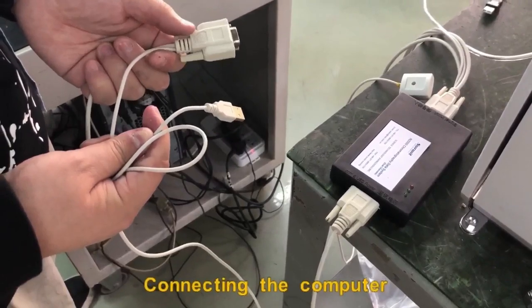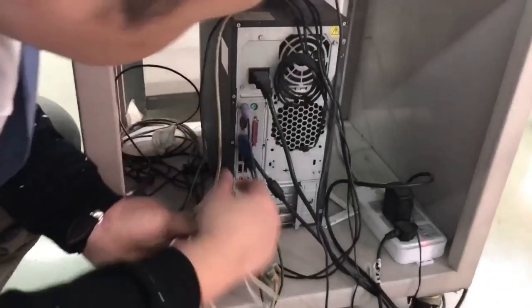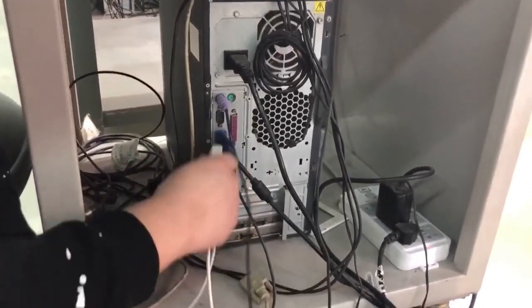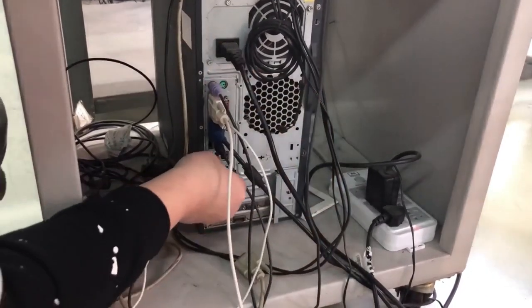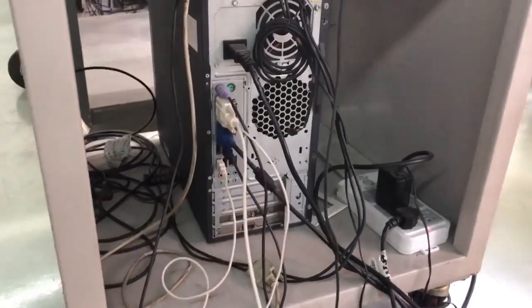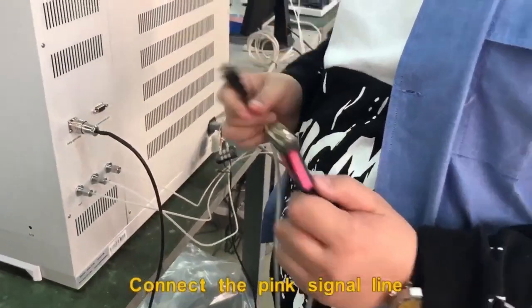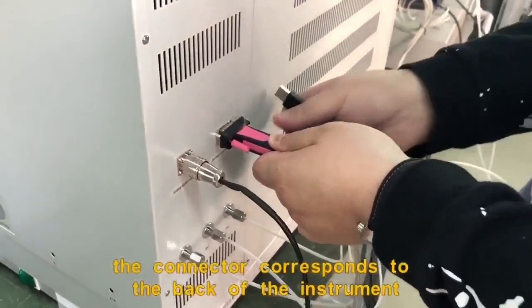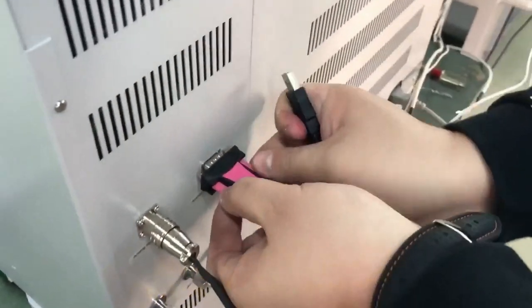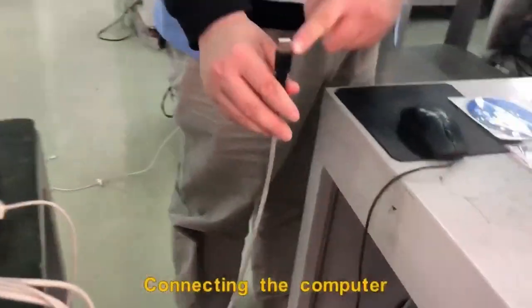Connect to the computer. Connect the pink signal line — the connector corresponds to the black port of the instrument. Connect the computer.